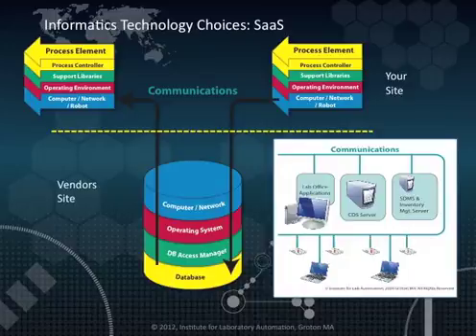One technology that is being offered by several informatics vendors is that of software as a service. The benefits to the user are speed of implementation. Since they are running the system from the vendor's site, the implementation is basically at no cost. This also means that the system can be put into service very quickly. All interaction with the system occurs over the network.